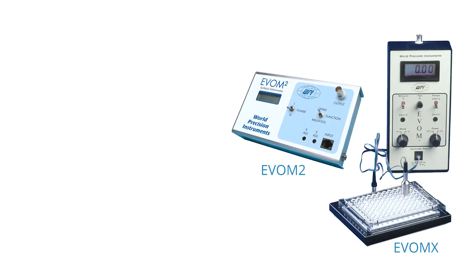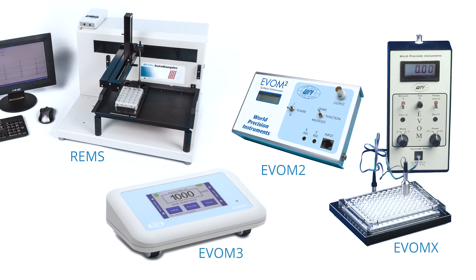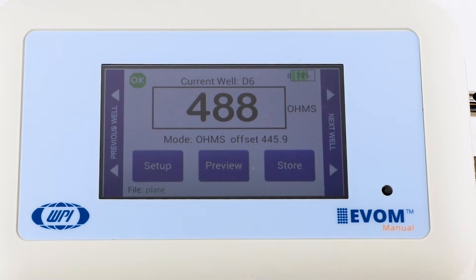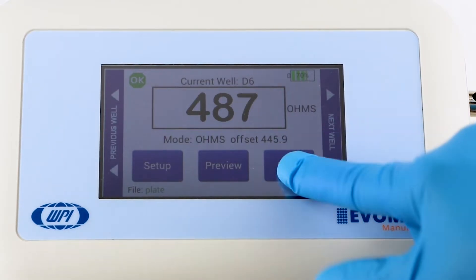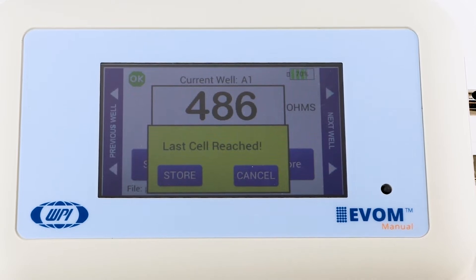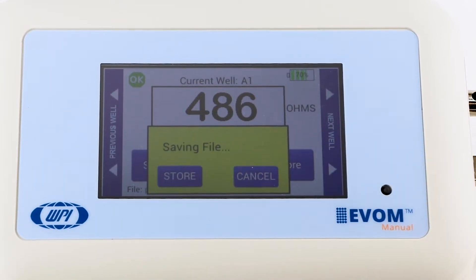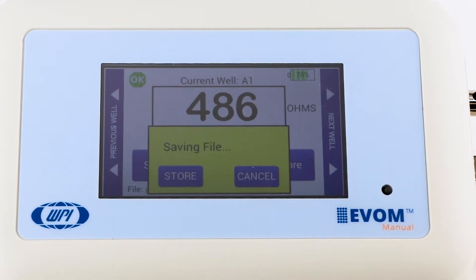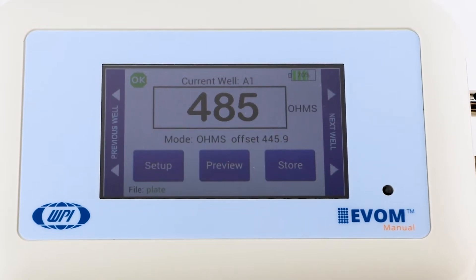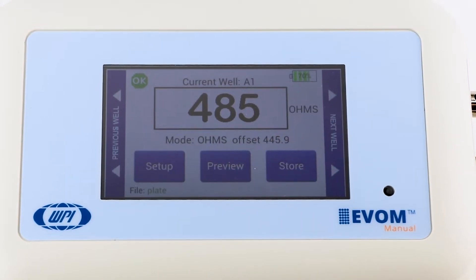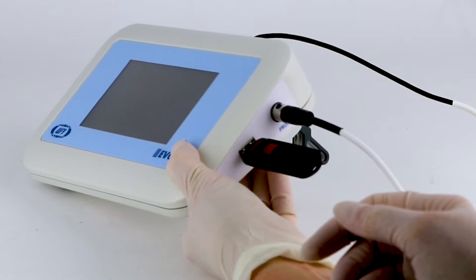EVOM Manual is powered by the same EVOM technology as our older EVOM models, and it has advanced features for performing experiments more easily. With the new touchscreen display, you can now store data as Microsoft Excel files on a USB flash drive.